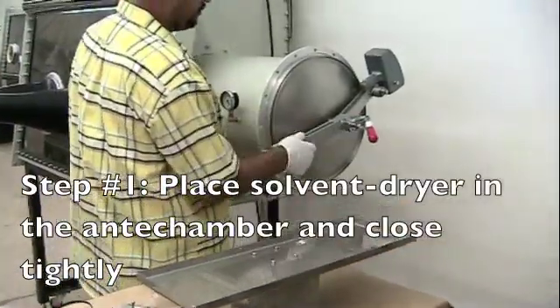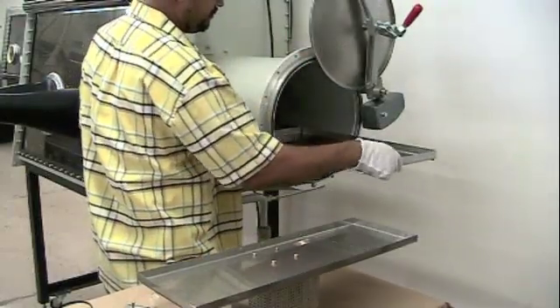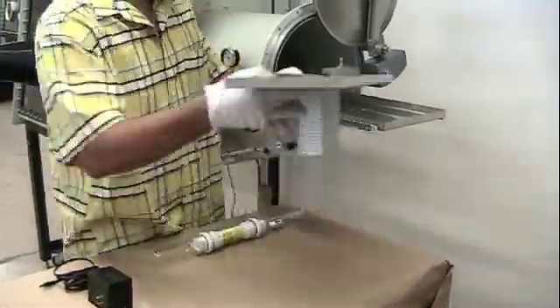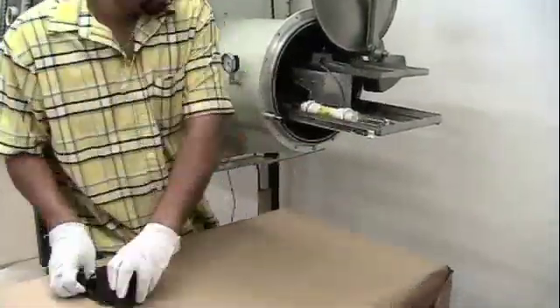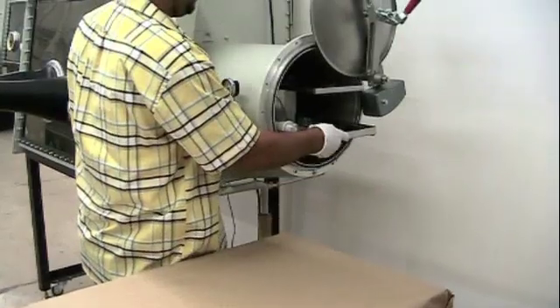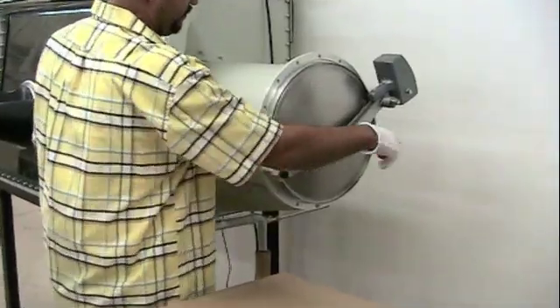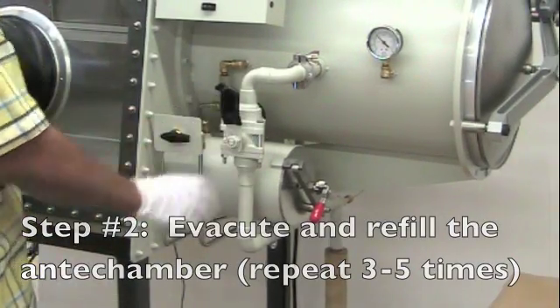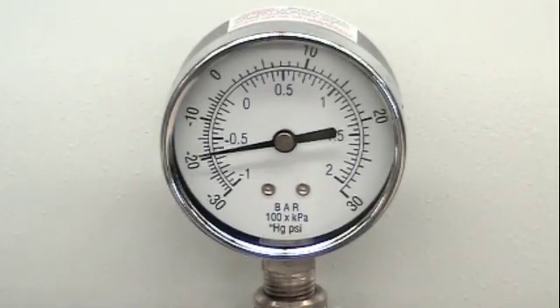To install the Inbox Solvent Dryer, begin by loading the Inbox Solvent Dryer and its associated components into the antechamber. Evacuate and refill the antechamber three to five times to ensure an oxygen and moisture-free transfer.